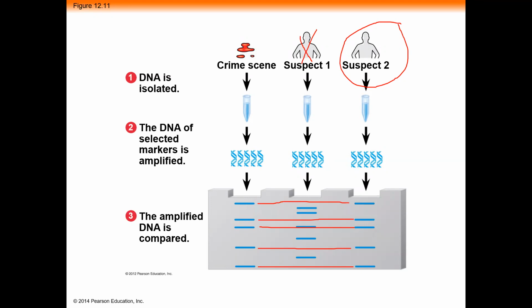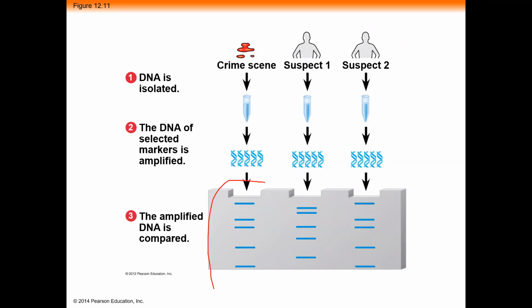This is also just getting back to, again, that horrible picture before. You could also, this is kind of what an RFLP gel would look like if you were trying to determine if a baby was related to a father.